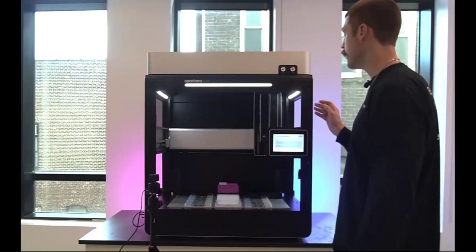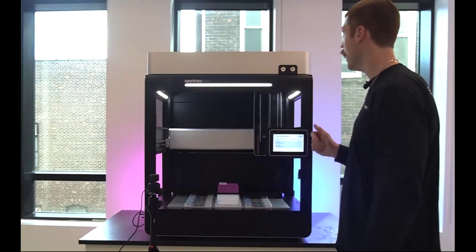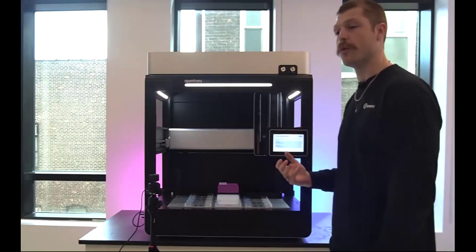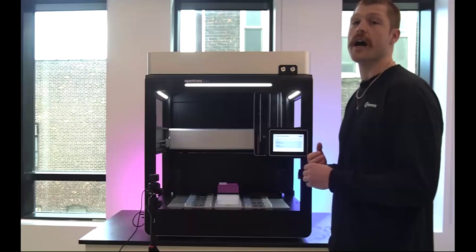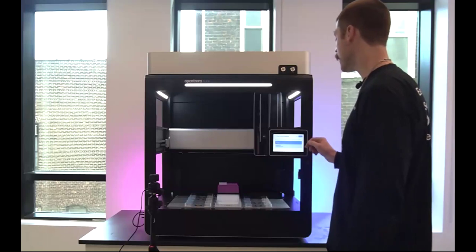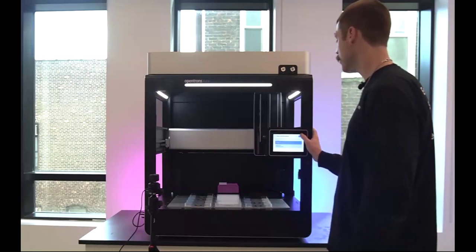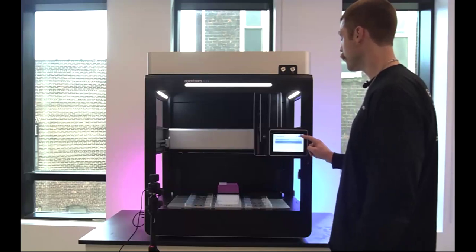I can choose which of the two mounted pipettes I'm going to do this work with. The Flex Prep, as mentioned, would only have one of these, but you can always add on and have more robot functionality. So if I'm going to do the left mount here to use the single pipette, I'm going to select that. I'm going to use filtered tip racks here. And then navigating down, I have a list of all of the labware that Opentrons natively supports.